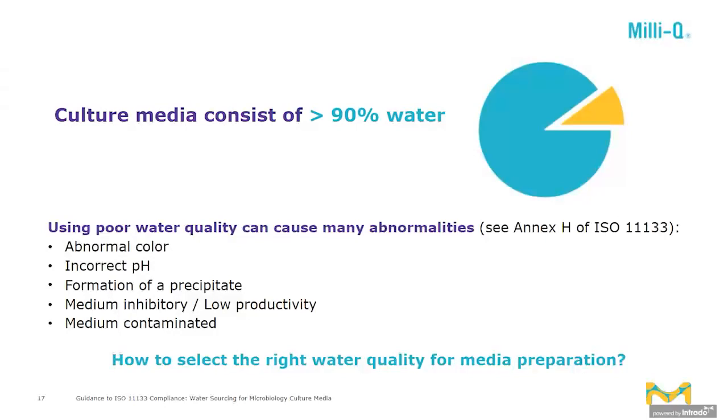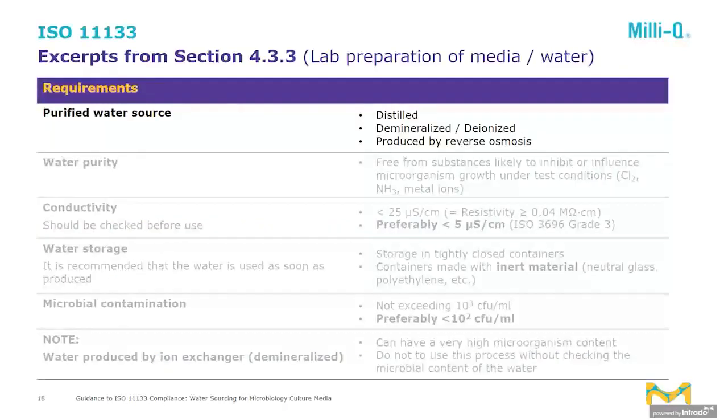So, having this in mind, how to select the right water quality for the media preparation? And to answer these questions, I would like to hand over to my colleague Estelle. Thank you, Barbara. All right, so how to select the right water quality? Well, actually, there is an entire section about this topic in section 4.3.3. And we will go through what it says because it has some very nice details.